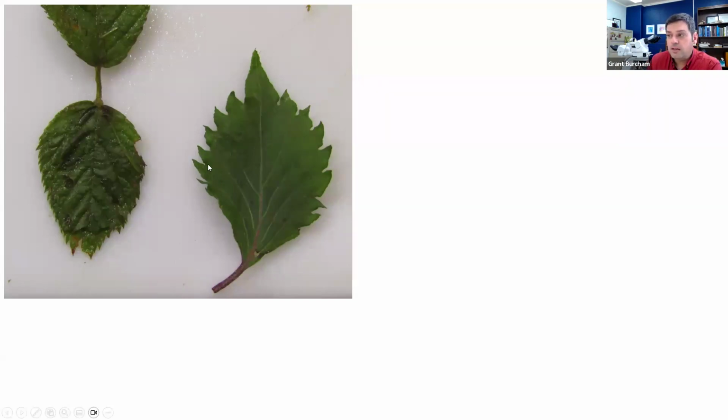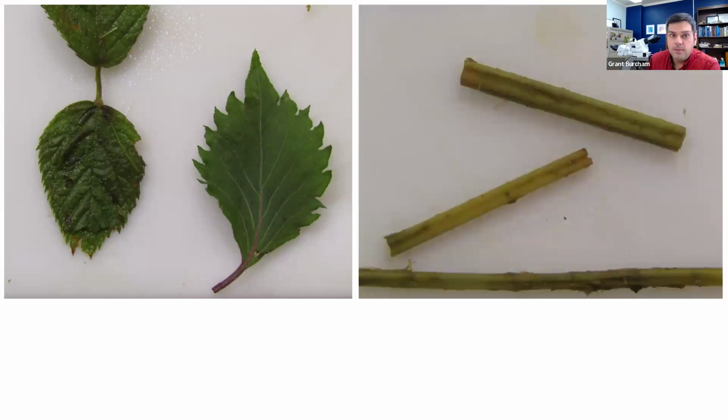And I found some leaves that look like this. As some of you may know, cattle don't chew their food super well the first time it goes down, and then they regurgitate it and chew it further, chewing their cud, right? So sometimes it's very helpful if you're looking for toxic plants to look in the rumen because the cattle might not have chewed it all the way. So I found some leaves that look like this, jagged edges, mostly green, and stems that look like this, right? You might recognize that these stems are square. They're not round like a lot of different stems.